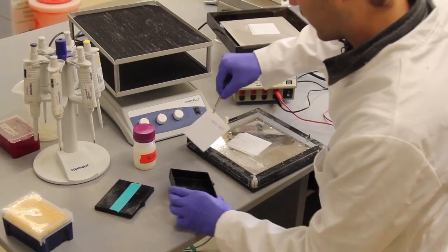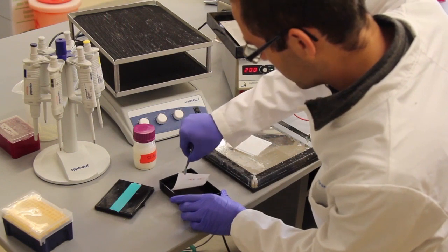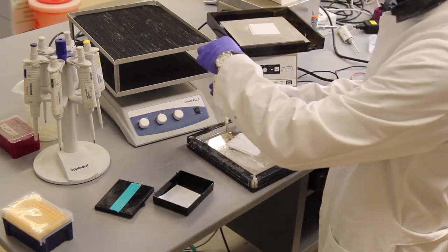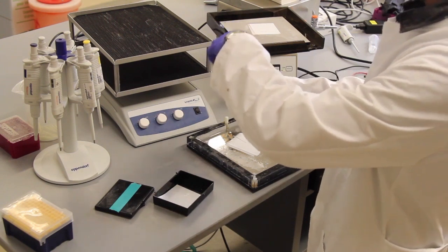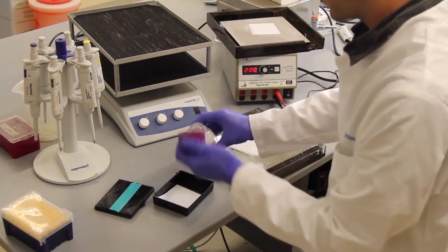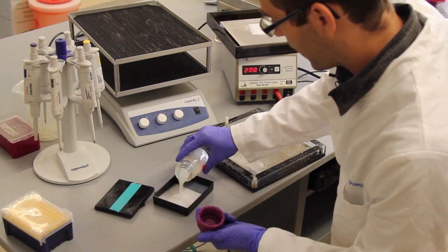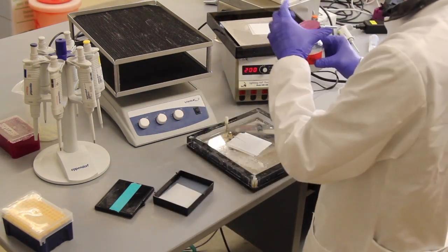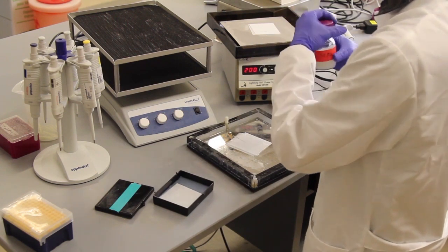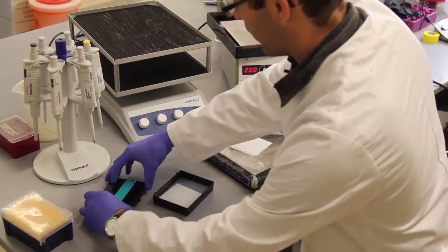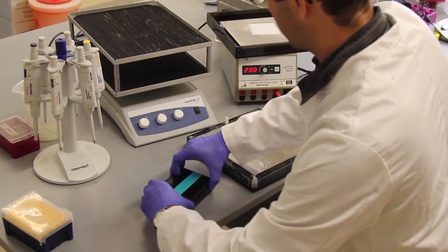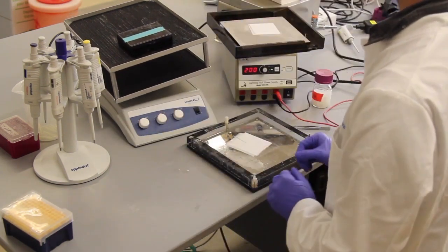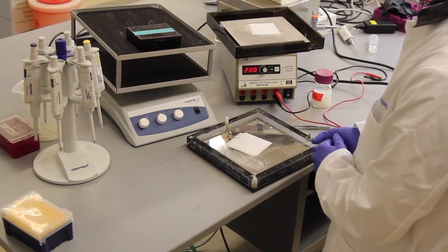The next step is for me to put this membrane into this box right here. And I'm going to add a 5% milk solution on top of it. And this milk solution contains some proteins, which will bind to any part of the membrane that does not yet have proteins attached to it. This will prevent non-specific binding from the antibodies later on. Close it up. I place it on the shaker, turn it on, and this now sits here for about one hour.